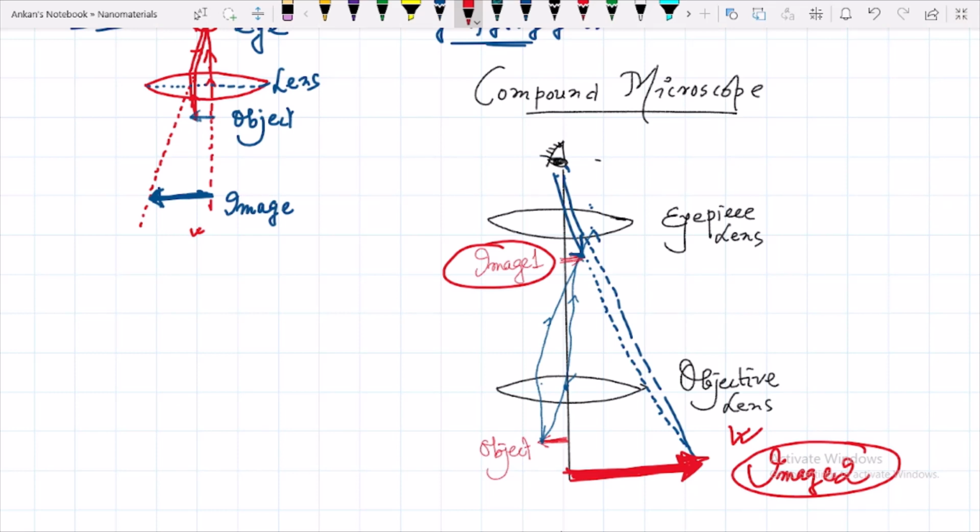These microscopical techniques employ visible light as the working agent for magnification, but nanomaterials are very small, and it is hardly possible to visualize them. This technique is applicable up to the micron level, of the order of 10 to the power minus 6.